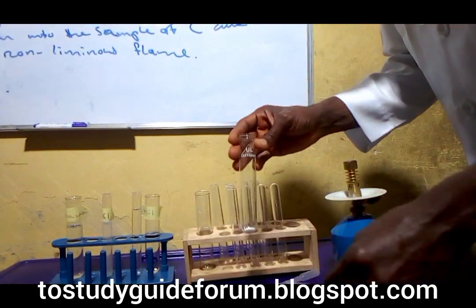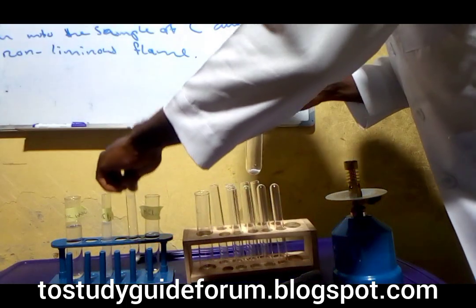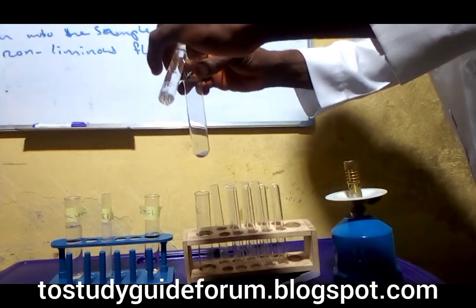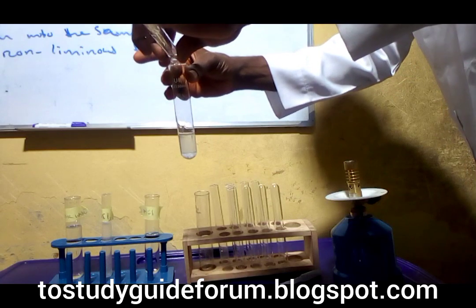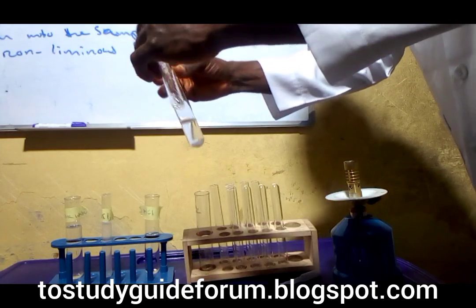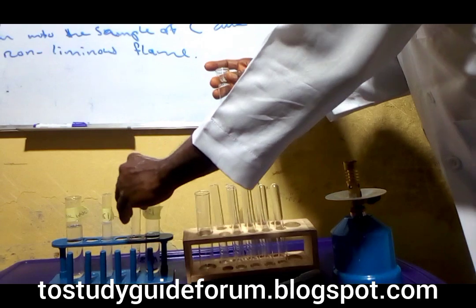Then we put some water. I said add distilled water. And then we shake.